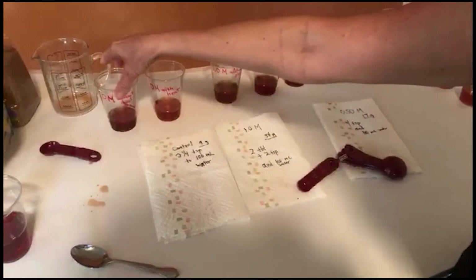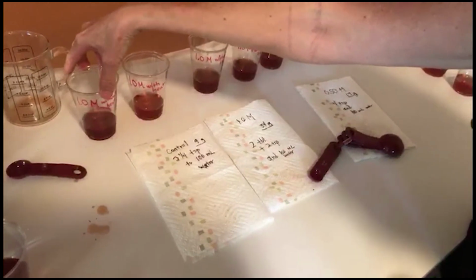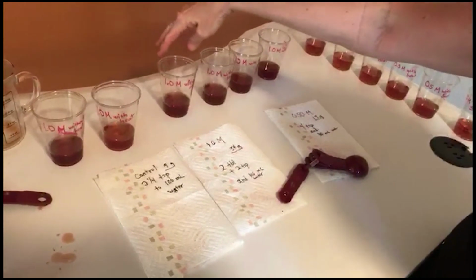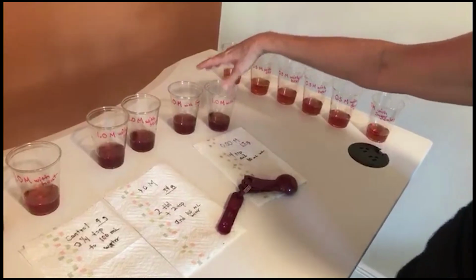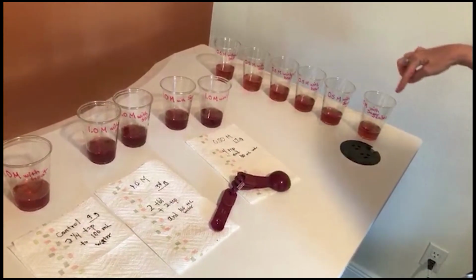I then poured 100 ml of each into the different solubility tests. So we have 1 molar with heat and without heat, 1 molar without stir and with stir, 1 molar with sugar cubes, and the same but with the 0.5 molar solution.